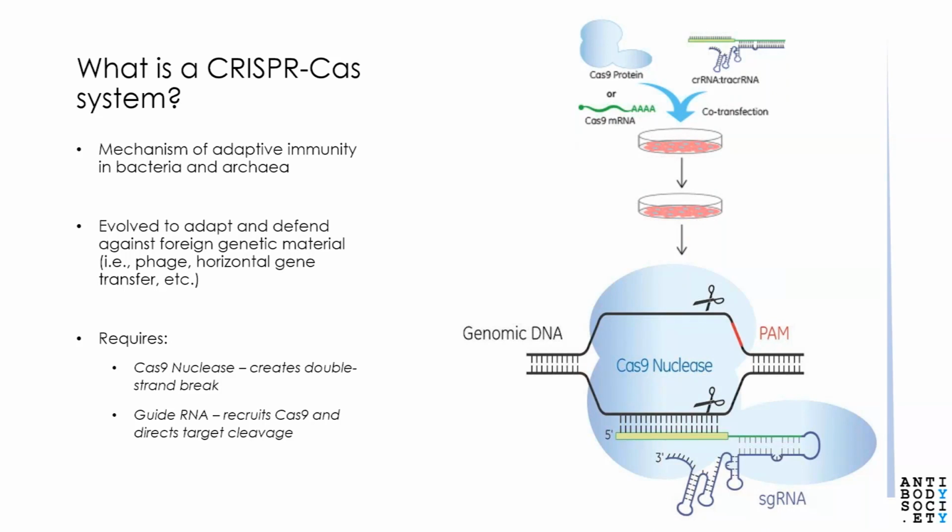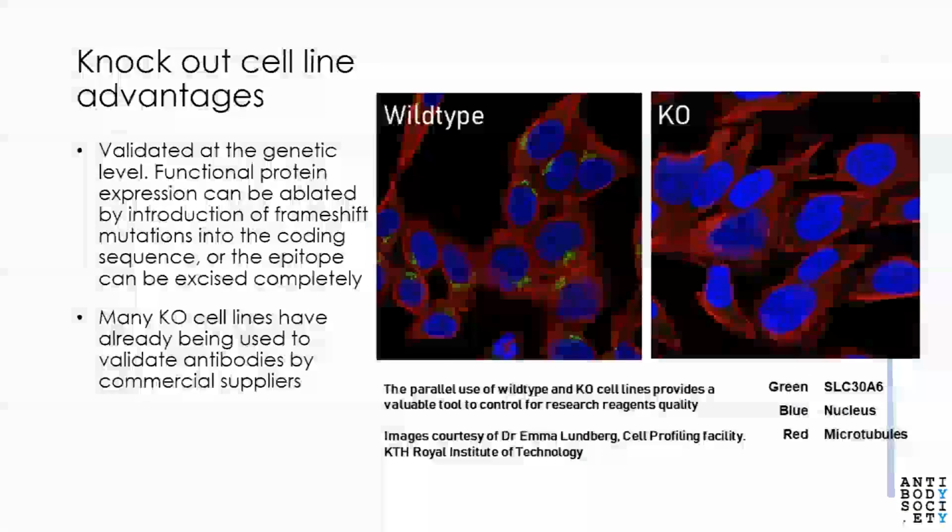From that point, after you get a robust enough population, researchers can design simple primers that are on the outside of where this genomic break should have happened using the Cas9 system, and use Sanger sequencing to further characterize what the indel of interest is for that particular clonal cell line. And so we've really harnessed this technology at Horizon Discovery and have been able to create knockout cell lines, a whole plethora of knockout cell lines.